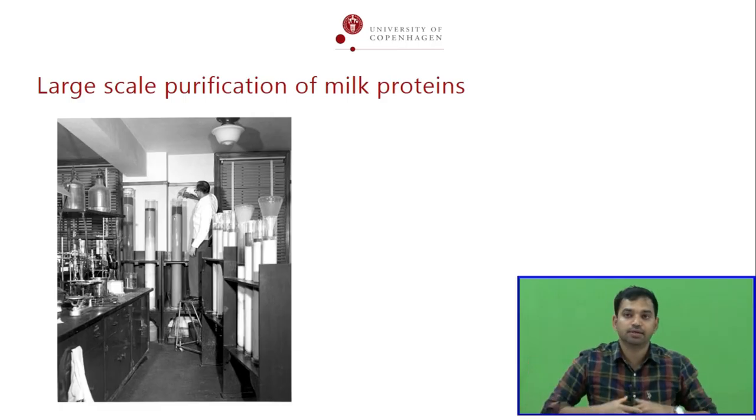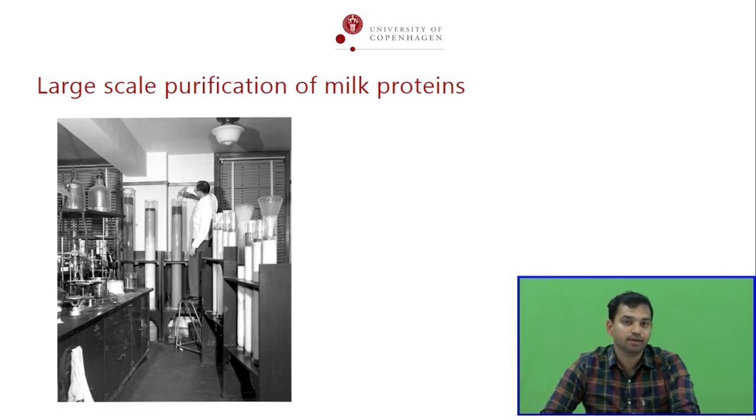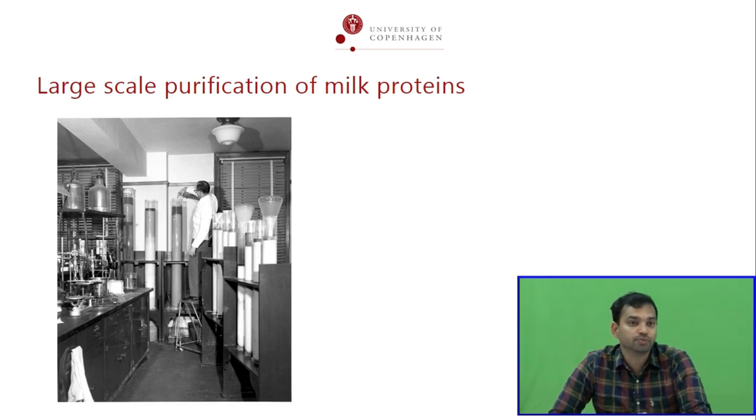And sometimes the ligand, the stationary phase that we use there, you can reuse. It's not that it's always use and throw. So you can reuse it several times, so you can make a high quality purification in a cost effective way. But I don't say it will last forever, but it can be used for several cycles depending on the impurities present.